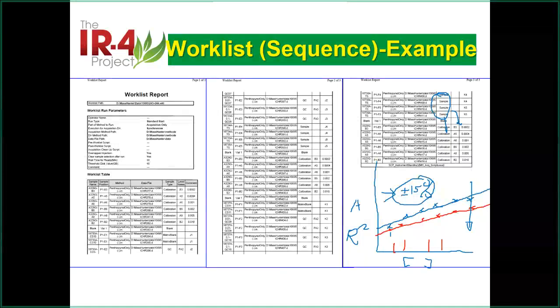Okay, what we do in our lab, we use both. We average them. We use every single point. This is 1 point, this is another point. So basically, if we have 6 calibration curves, we use 12 points for calibration, so 2 of them the same. If you do the double injection, then that will be 24 points for one. And if you treat each one as a different number, different points, the R squared value will change significantly, will go down significantly.